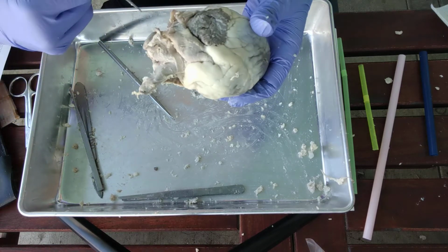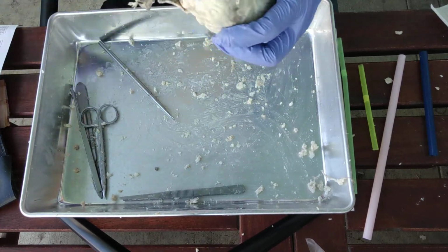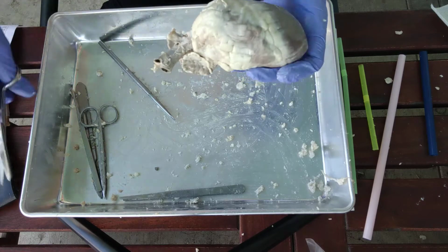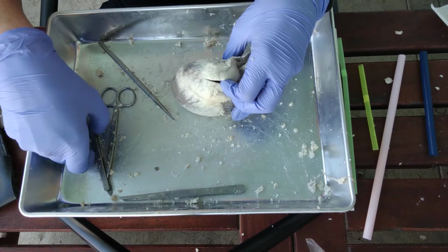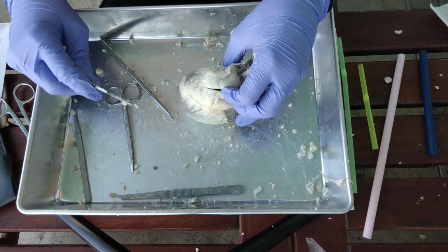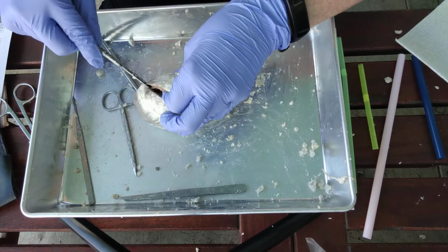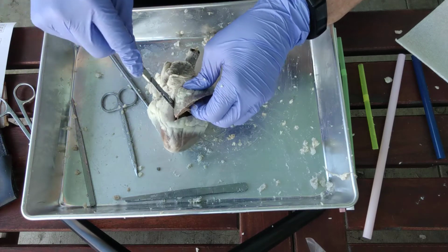Okay, so I'm going to start with my scissors. Actually, if you have bigger scissors, now is a good time to use them. If not, your little scissors should work, but they might be a bit trickier to cut through. Once you've made your starting cut, again, do not pass the anterior interventricular sulcus. Don't do it. You can cut with your scalpels. Remember, for the scalpels, do not cut towards your hands, and always cut towards the tray. Do not saw back and forth. Always only cut in a single direction. It might take a couple of times to get through it. Go all the way as far down as you can, and then make a V cut back up.